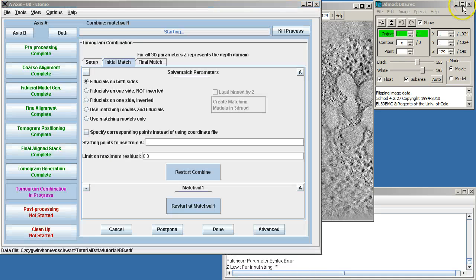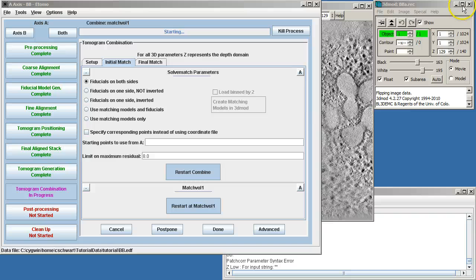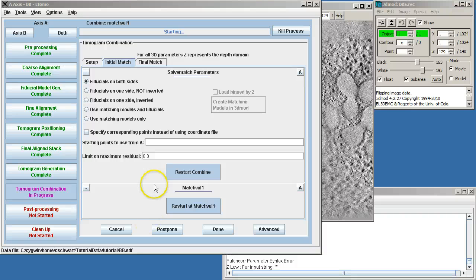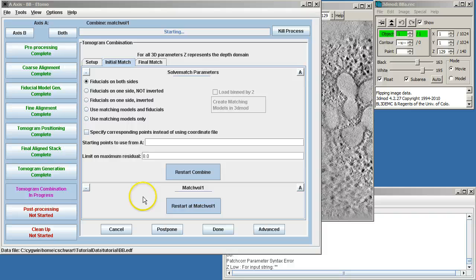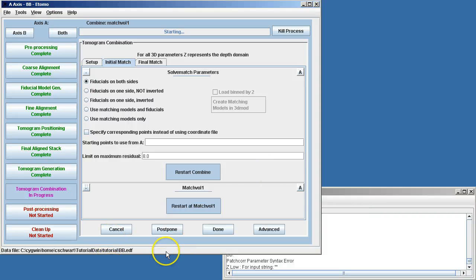Now this process happens very quickly. I'm just going to pause here and explain that the initial match will happen quite fast, and then it will quickly go to the final match. The initial match is if there's a failure, it can easily be fixed. In this case, it will not fail.